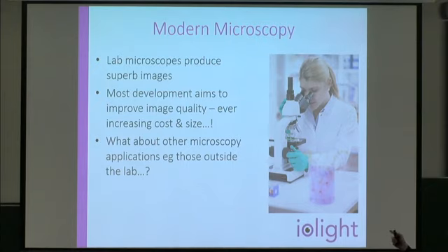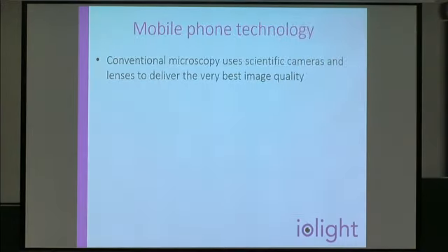But what about all the other applications for microscopy? Often those outside of a lab. Things like in clinics, in veterinary, environmental science, agri-tech and things like that. So what we've been doing is applying mobile phone technology to achieve this kind of thing.